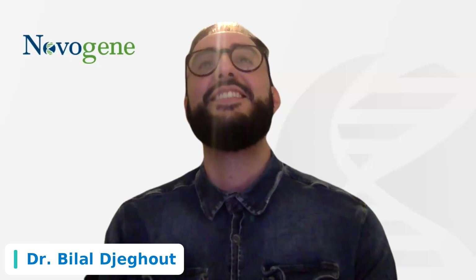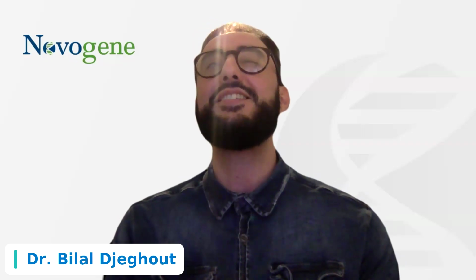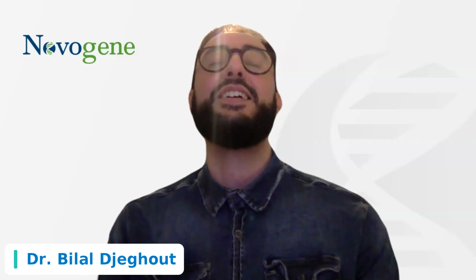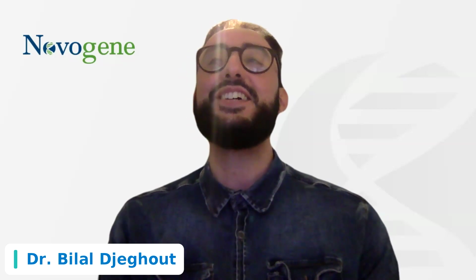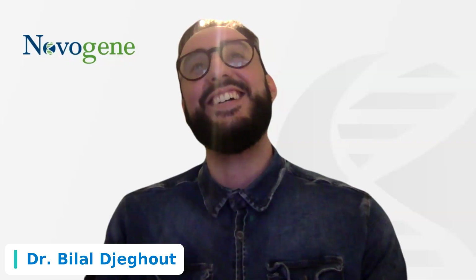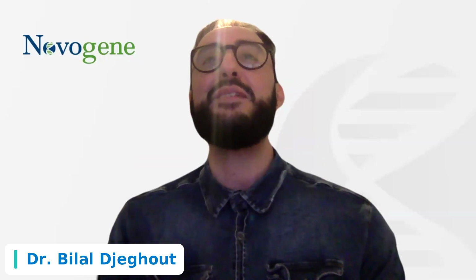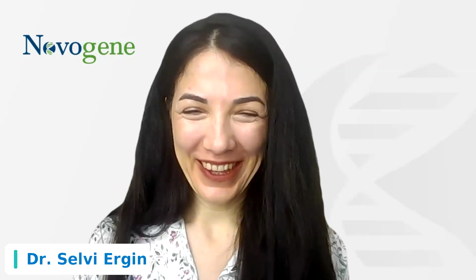The question is about sequencing depth, and I haven't mentioned the depth. In this project, I used 10 gigabytes per sample, and usually that's enough. But there is also the cost, because once you go deeper, you pay more. If you are interested in one specific sample, maybe you can go even higher. So, thank you. You're welcome.